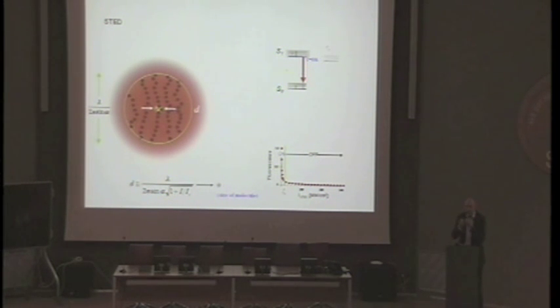And so this is how I separate the molecules. So again, we can have molecular scale resolution, although we use regular objective lenses. That's the point. And normally propagating light, again, by having them in two different states at a time point of measurement. So this is, of course, a paradigmatic change in what people can now imagine that a light microscope is capable of doing.